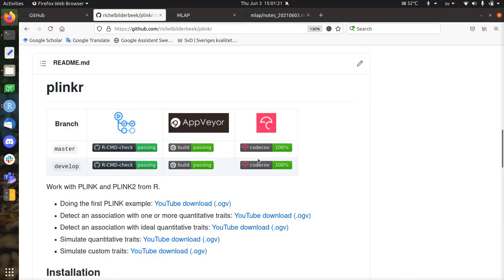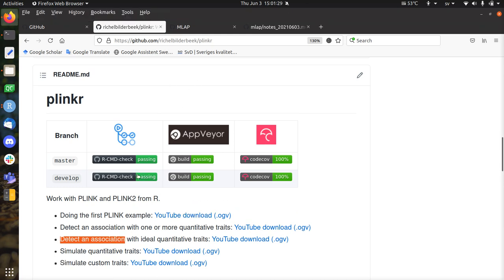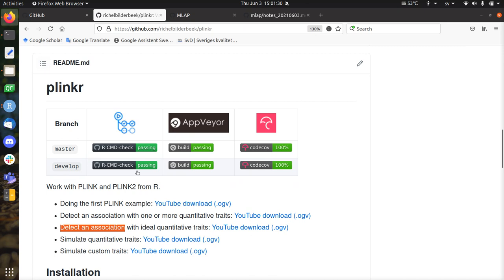Hi, I would like to talk about Plinkr and how it can detect an association with binary traits. So Plinkr is an R package that works with Plink1 and Plink2. It installs them separately so you can just say or the one use Plink2 for this and Plink1.7 for that analysis.